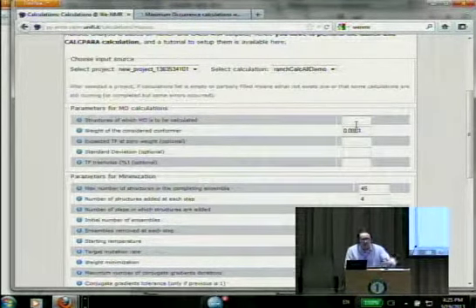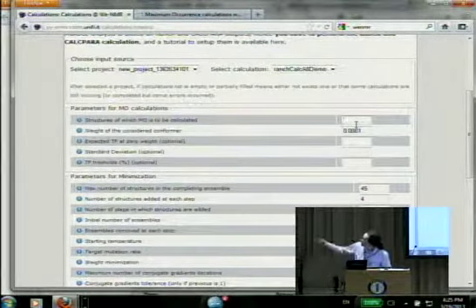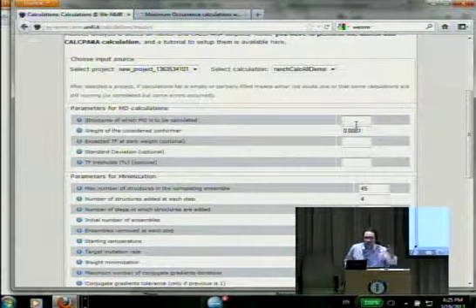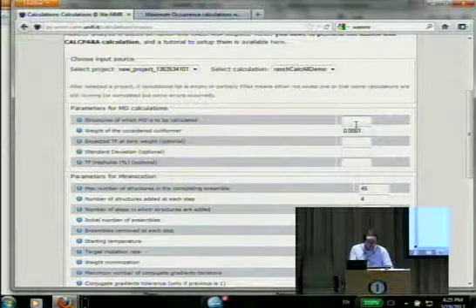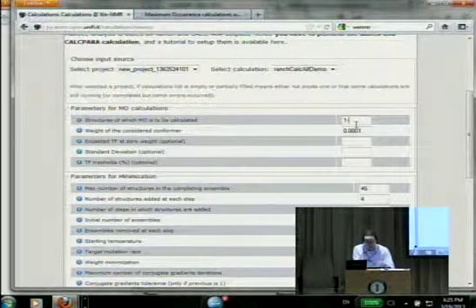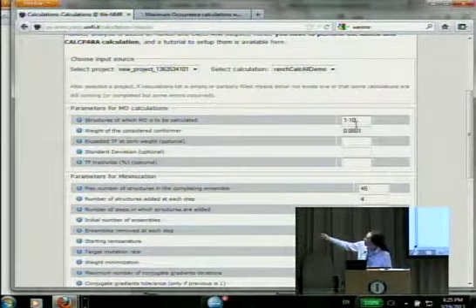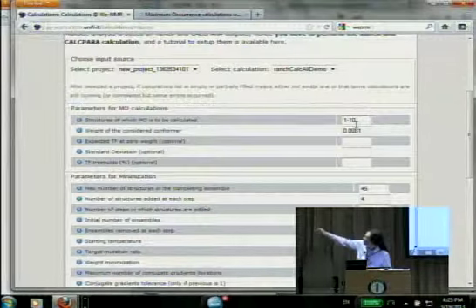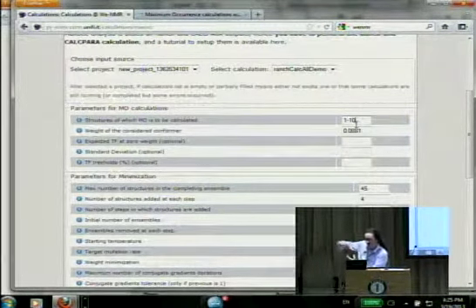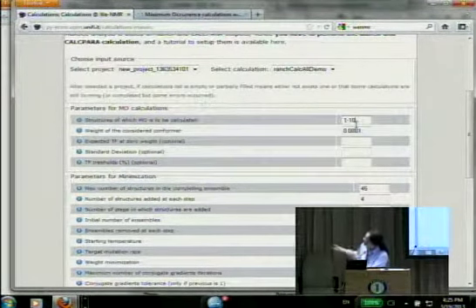So this will take the first 10 structures in the pool of configurations that was generated, and we'll use them to build 10 different ensembles. As I said, the advantage of using an index actually is that if you want a specific structure analyzed, you just add it to this pool of configuration, and then you know that the program is going to pick that. Otherwise, if it's random, you would never be sure what's going on.